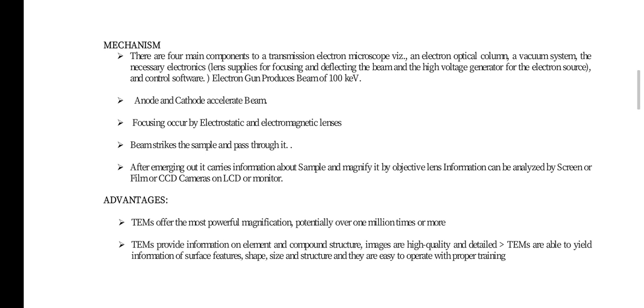The beam strikes the sample and passes through it. After emerging out, it carries information about the sample and is magnified by the objective lens. Information can be analyzed by screen or film or CCD cameras on an LCD or monitor. And advantages of transmission electron microscope.